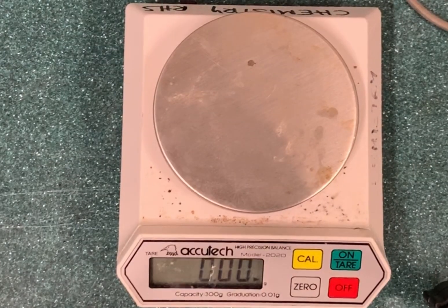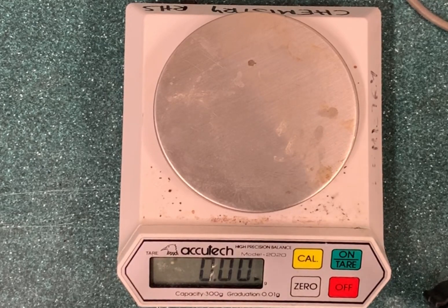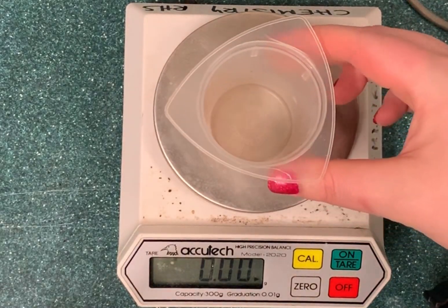This clip shows the method of weighing by difference. This is when you put your weighing boat or your beaker onto the balance and you do not press the zero or tare button. For this method you need to write down the mass of your beaker.